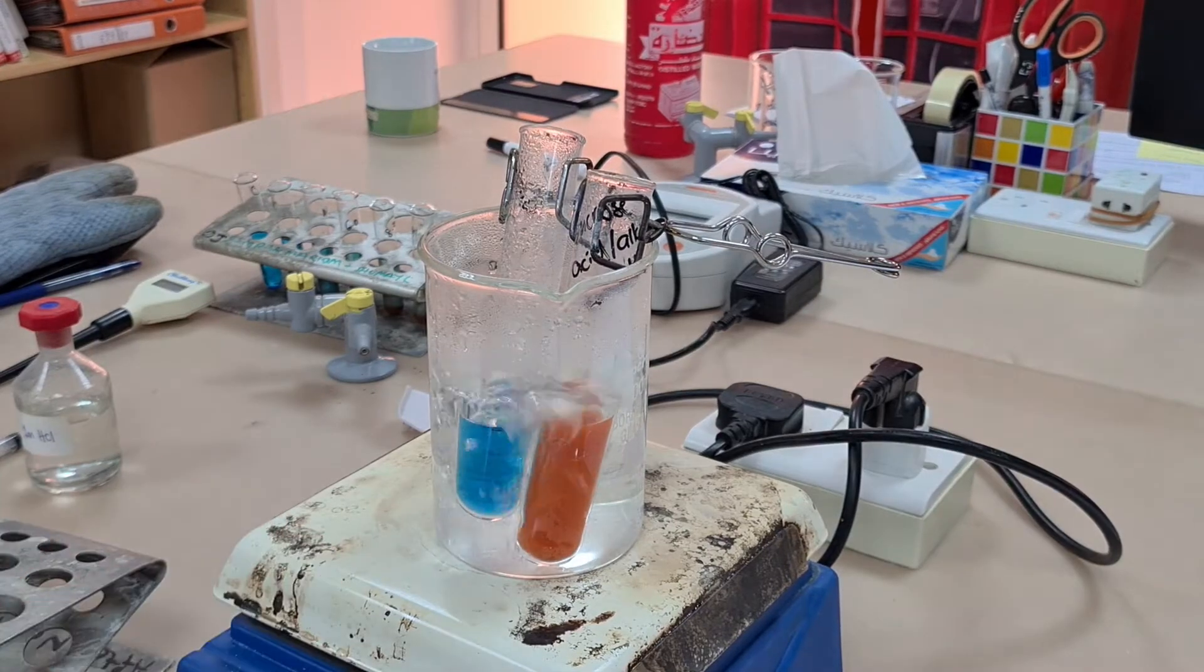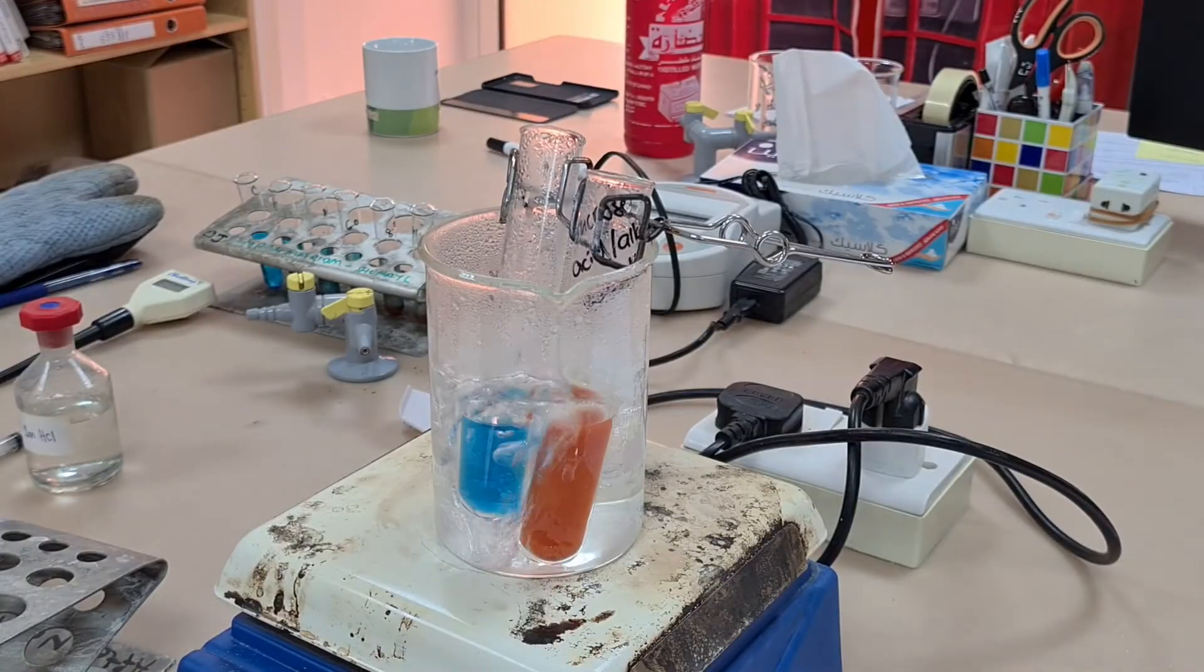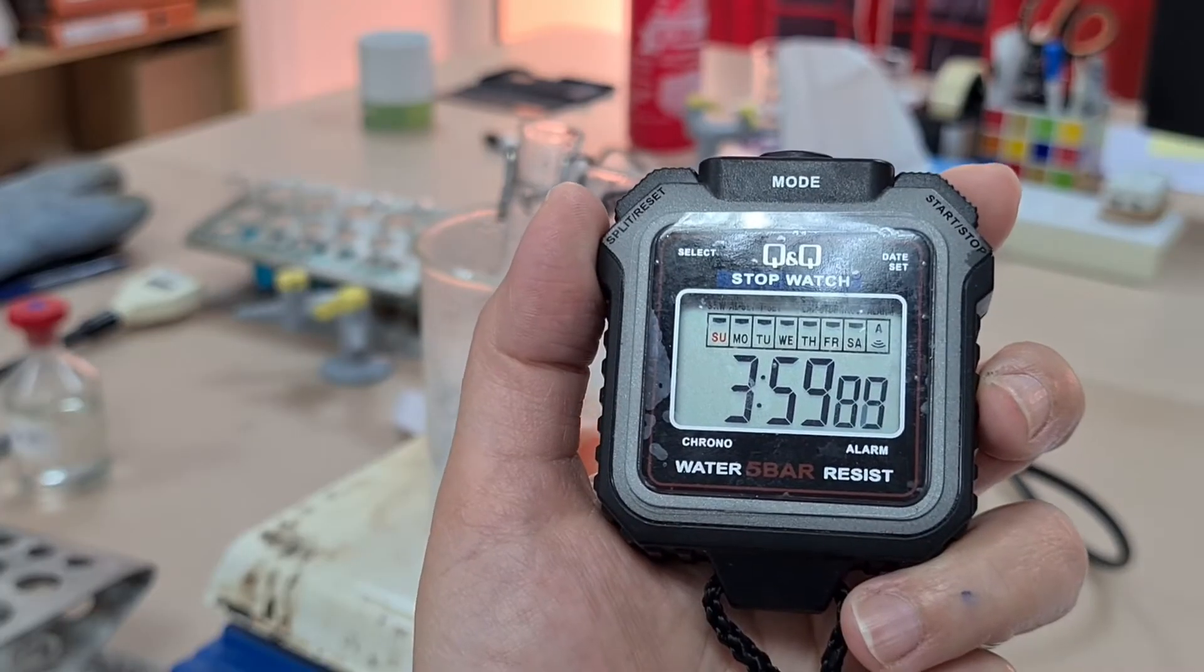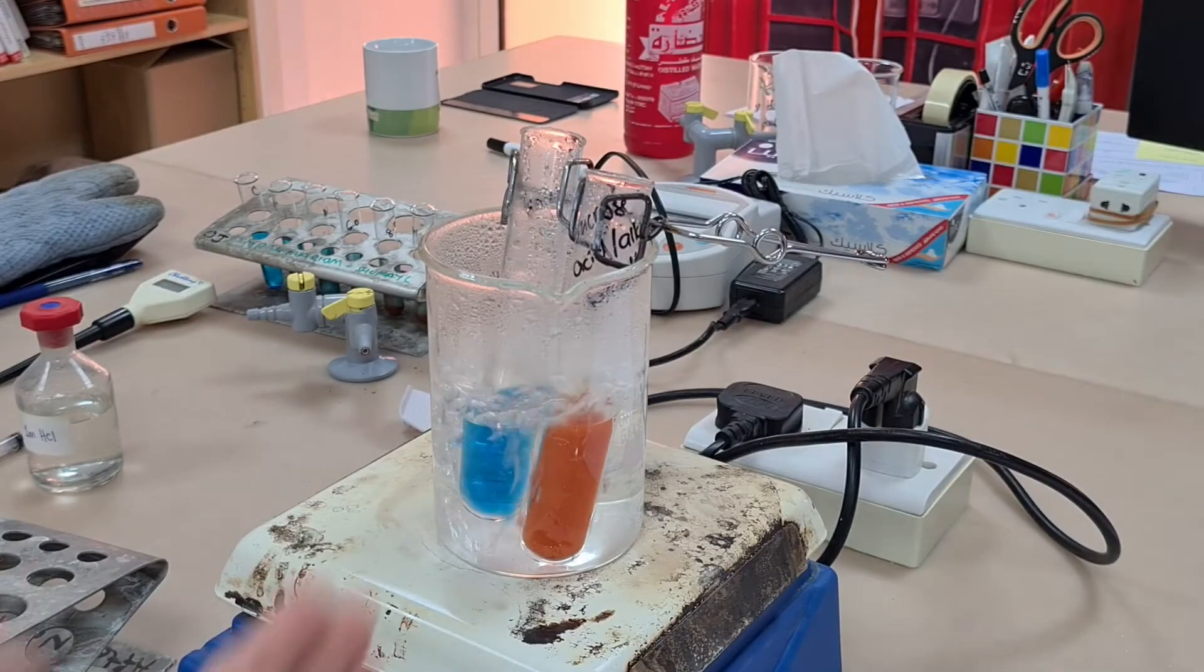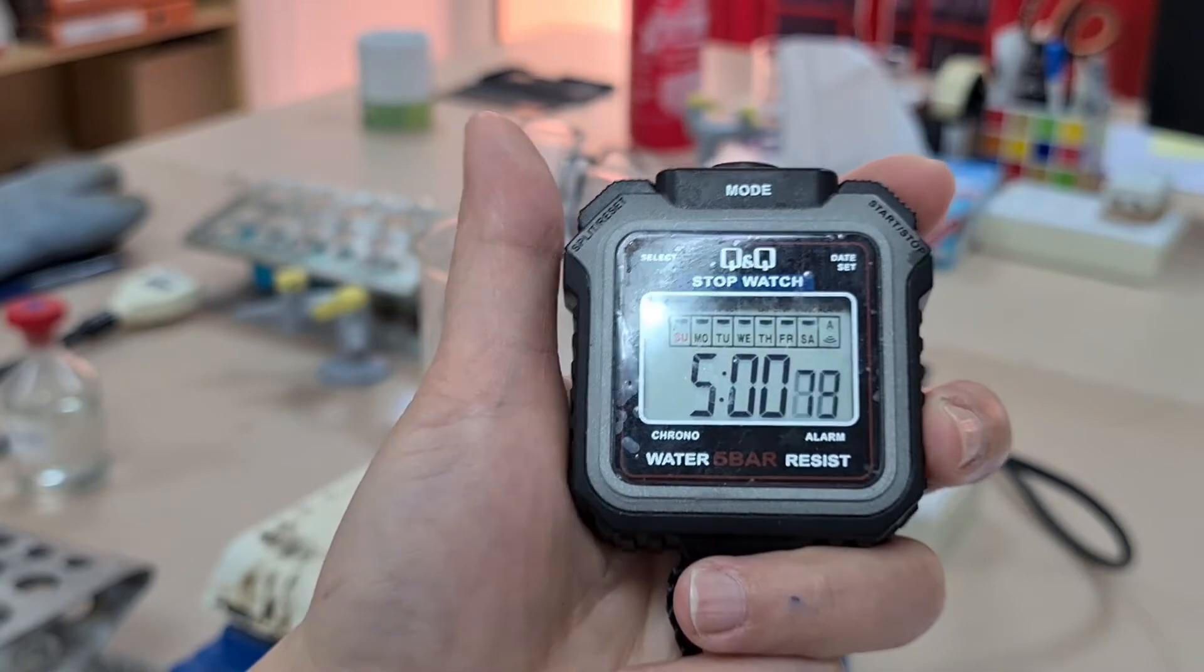So this is the test for disaccharides. The test tube on the left shows us that testing it with Benedict's reagent gives a negative result. Why? Because Benedict's reagent can only be used with reducing sugars. We used sucrose, this is a non-reducing sugar.